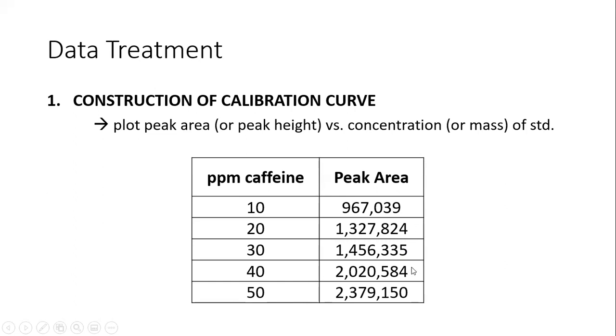Okay. Tapos kung ano yung makuha yung peak area doon, just multiply it with the corresponding dilution factor. Okay. Kung mababa naman siya dito sa lower limit ng calibration curve nyo, what you could do is to add more standard. So mas mababa pa dito sa 10 ppm. So you also should include a blank. Okay, para pwede siyang from zero as well. Okay.